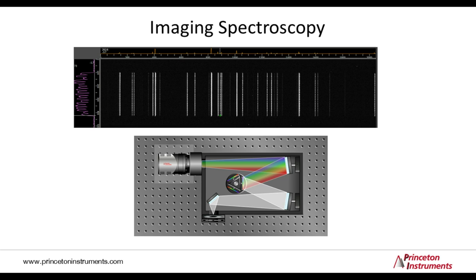So let's look more into the instruments that are used to acquire the spectra. I've already mentioned that grating spectrographs are widely used, and often these days instruments use two-dimensional detectors like CCDs that are capable of detecting a two-dimensional image. For example, here one can see an image of a fiber bundle on a CCD. There's extent in the Y direction as well as X, because there are different wavelengths going through the fiber bundle, so they're detected at different places on the detector.